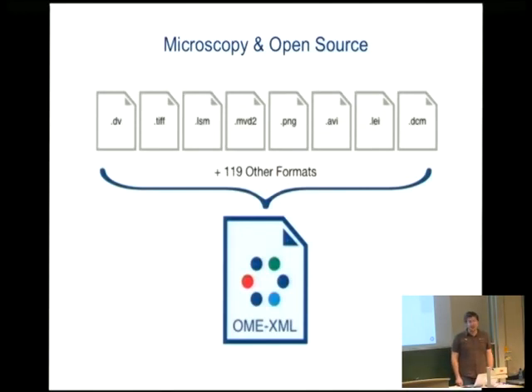As Balaji said, the microscopy world is really proprietary. All the instruments being built cost hundreds of thousands of pounds in some cases. So the vendors have obviously invested a lot of money in it and would like to lock you in as much as possible. What generally happens is they've written some specific acquisition software which comes with their instrument, and it outputs a specific format.